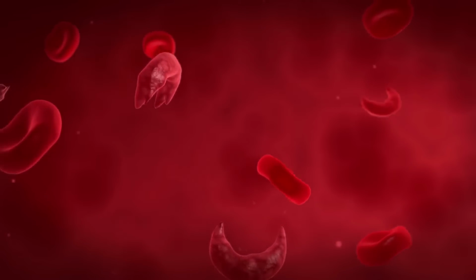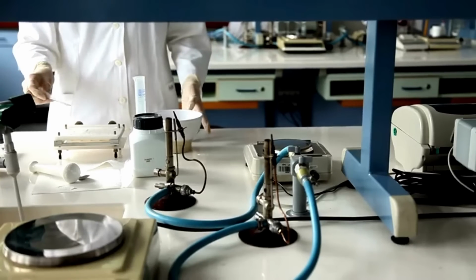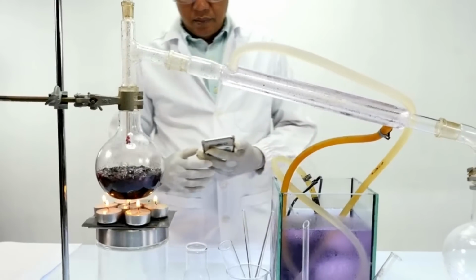Urine sediment exam. Centrifuge urine sample to concentrate cellular and cast sediments. Resuspend the sediment for microscopic field examination. Tissue sections. Fixation, processing, embedding, microtomy and specialized stains allow studying cell or tissue architecture.